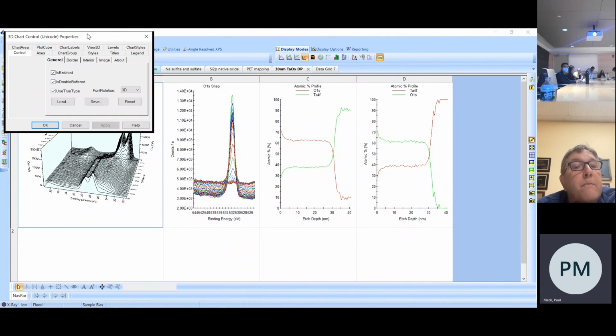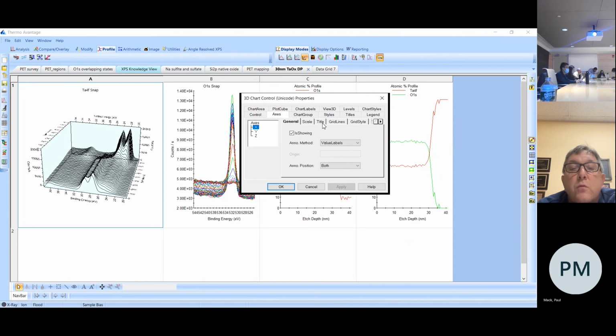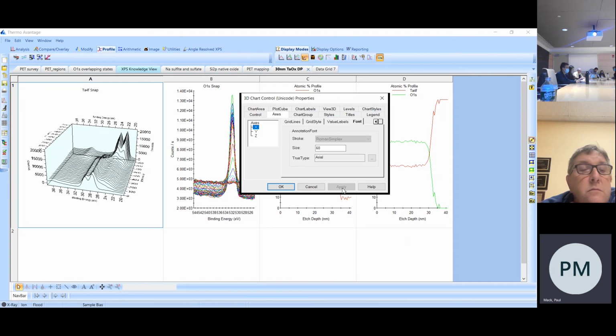I must confess, I don't use montages too much. It might be a little different now with version 6. Is there a font control? Yes. You could try changing the font size. Unfortunately, particularly in version 5, the nature of the display engine does look pretty ropey.